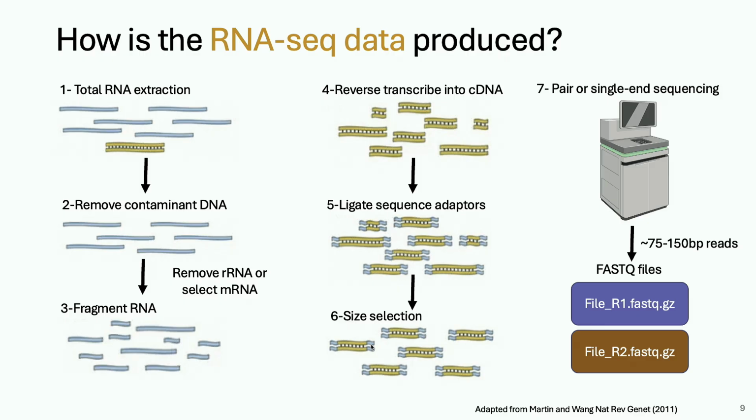Why is this important? Because before this strategy, when you fragment cDNA instead of RNA, you have a mixture of cDNA of various sizes, because not all the cDNAs are full length. So at the end of the day, you will get a biased library. Either it will have a 5' bias or a 3' bias based on what kind of library you are preparing.